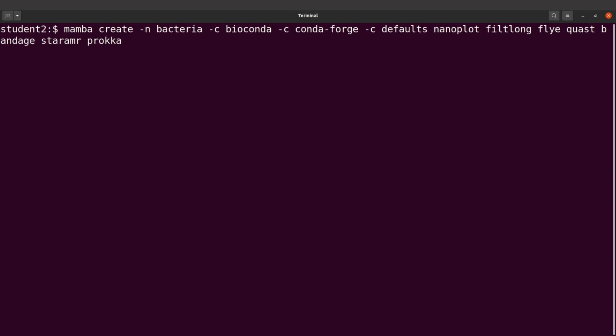Now there is another tool that has not been listed here. We are going to install it later. That is JBrowse. So we are going to install that when we are about to use that. I tried initially, but I realized using Mamba to install, I was not able to open it. Or let me just say the tool was not working to my satisfaction. So I thought I will install using another approach. So for the most part, we are going to install the tools using Mamba.